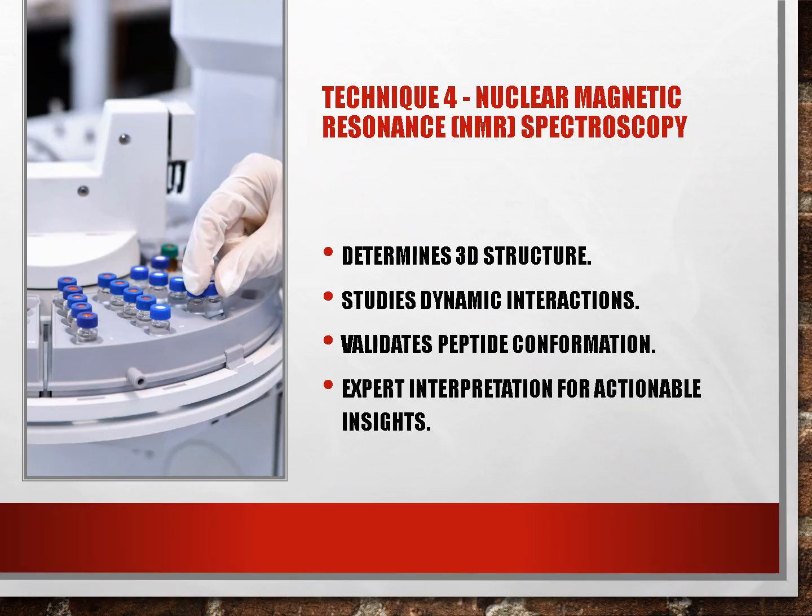The fourth technique is NMR spectroscopy. Unlike MS and HPLC, which focus on composition and purity, NMR gives us a window into the 3D structure of peptides. NMR allows us to study how a peptide folds, interacts with other molecules, and behaves in different environments.